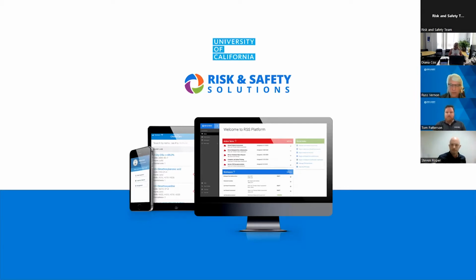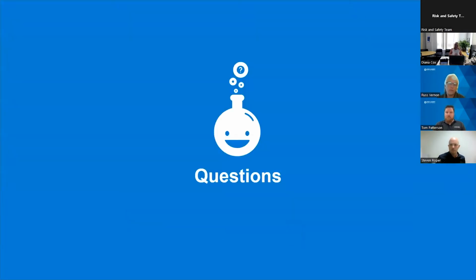So first question I'm going to ask, actually, we're going to go over to Russ. But I think the first thing when you're talking about a chemical inventory system, before we jump into the FAQs, the frequently asked questions that we get, it always comes back to, what quantities do you want to track? And I think, Russ, could you expand a little bit on the different uses for a chemical inventory system and why that might impact your quantities?